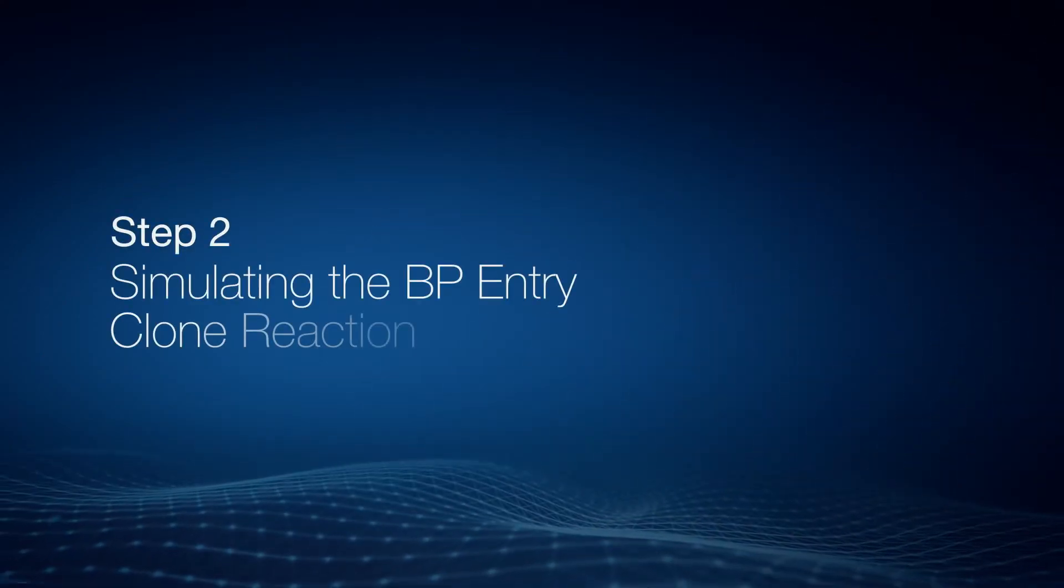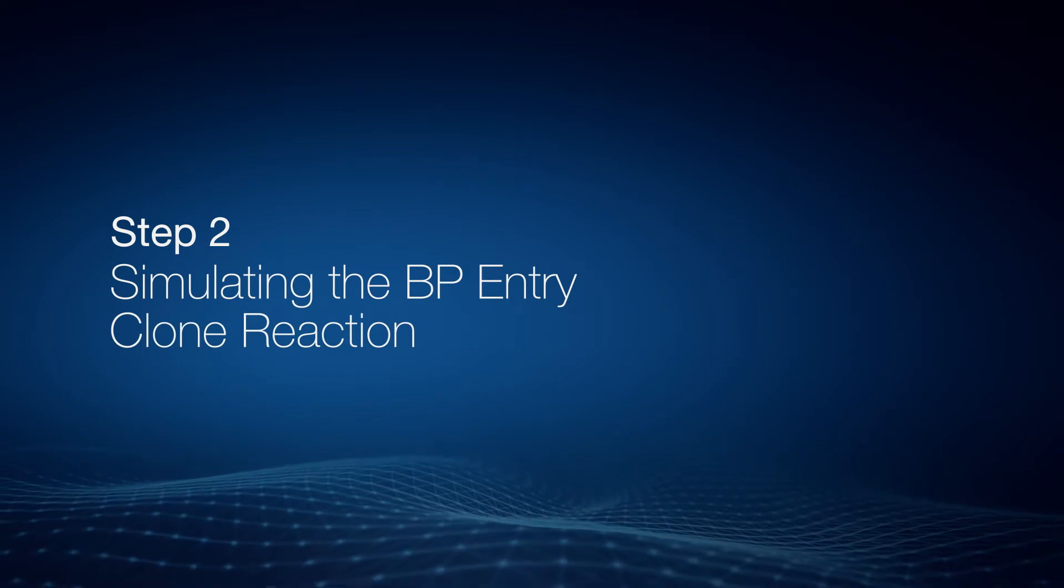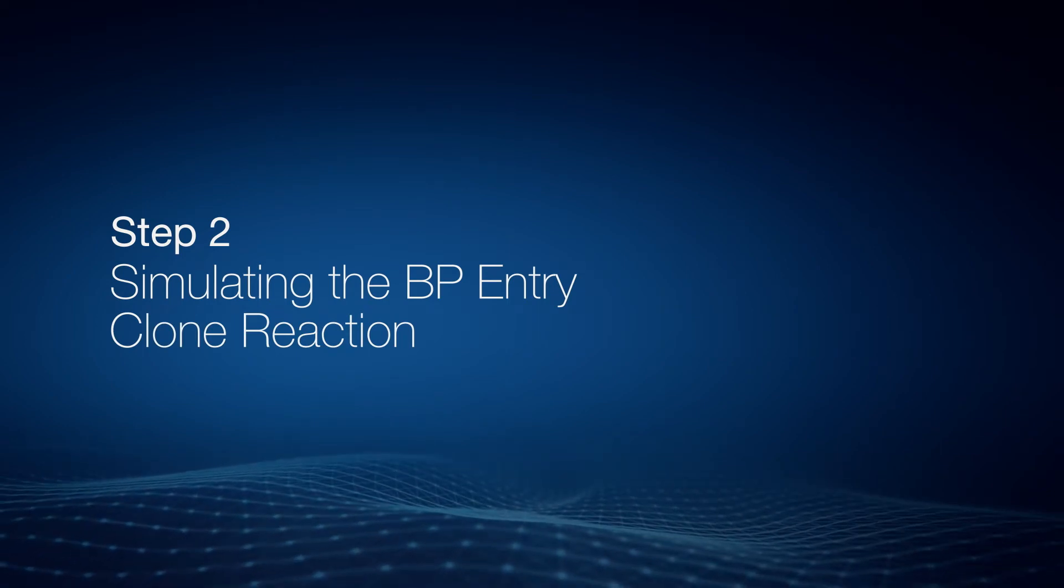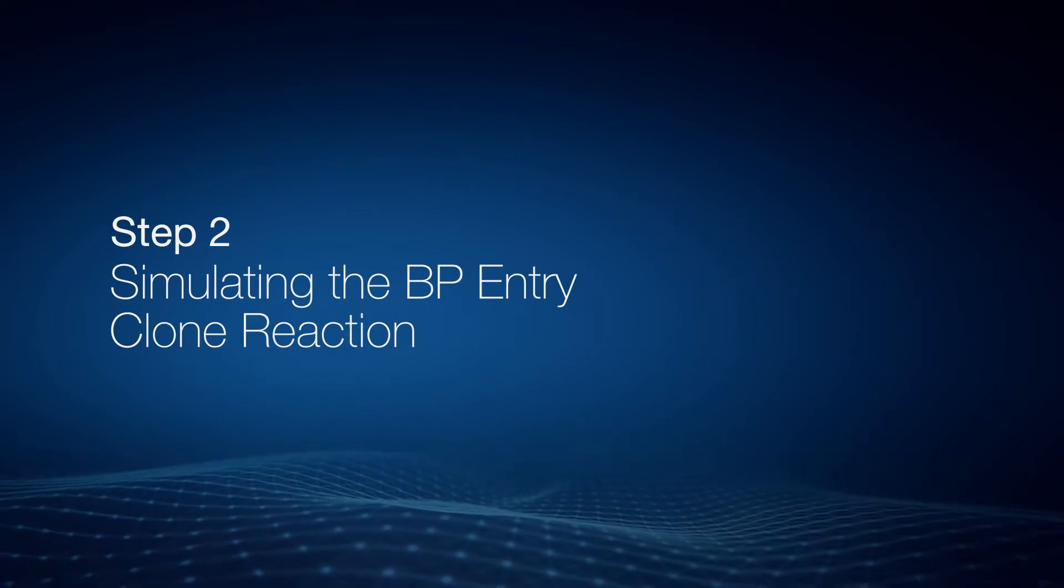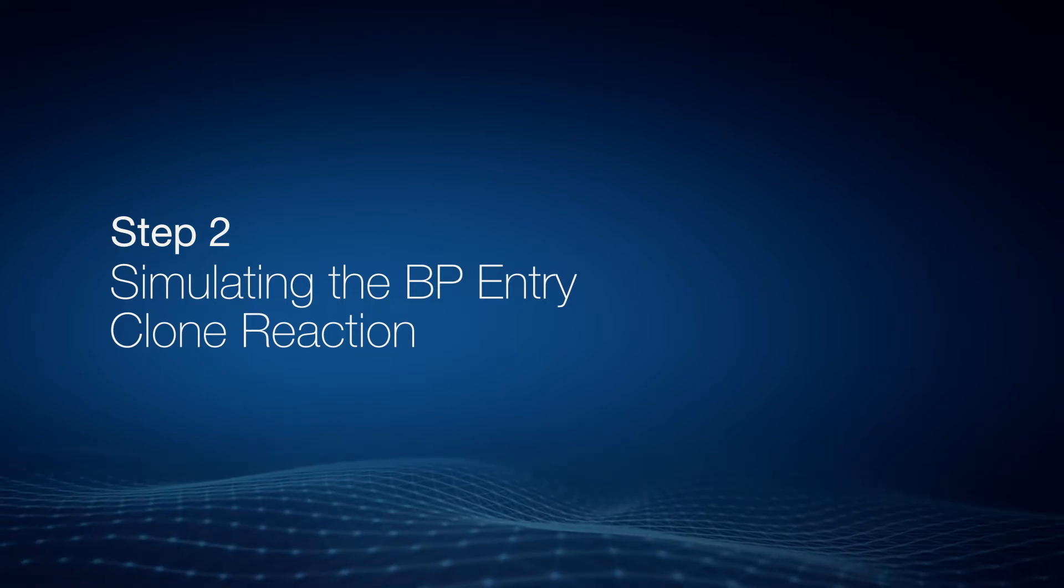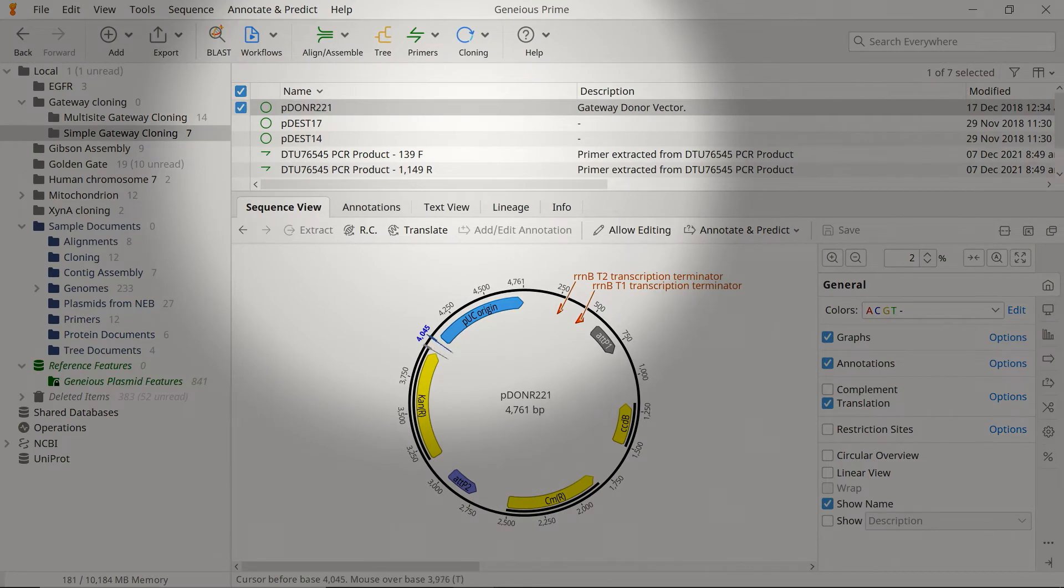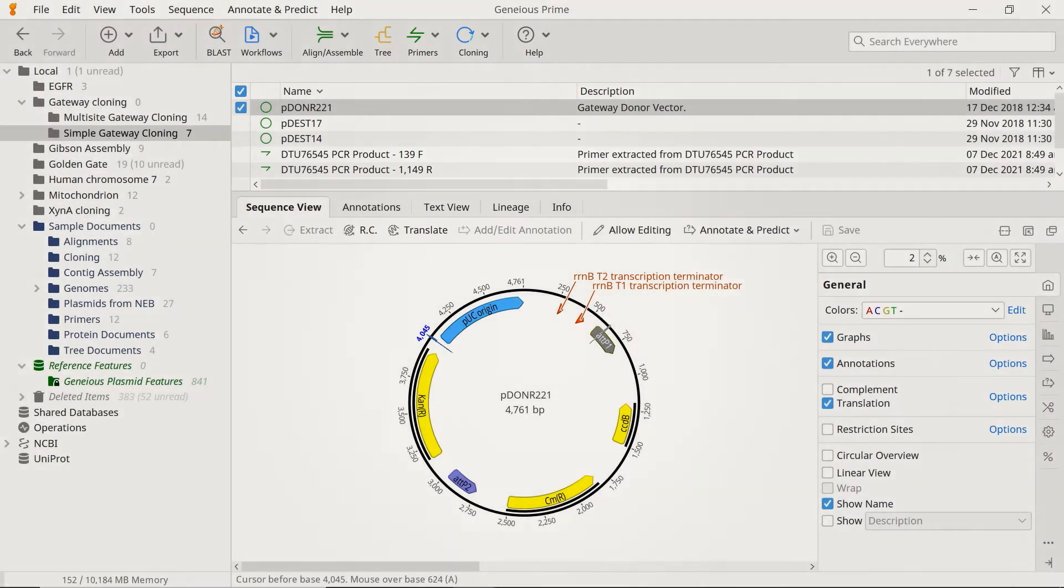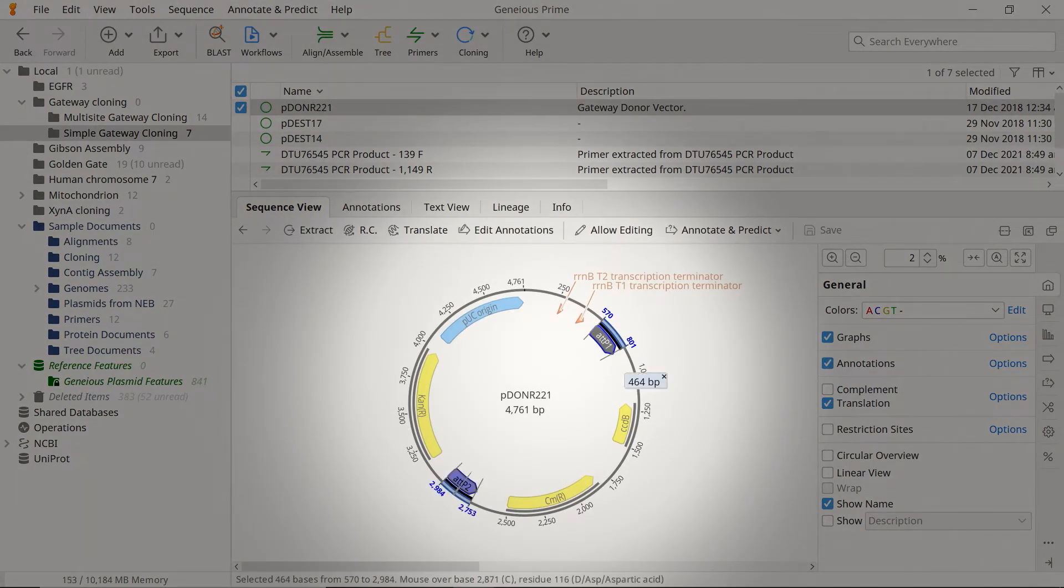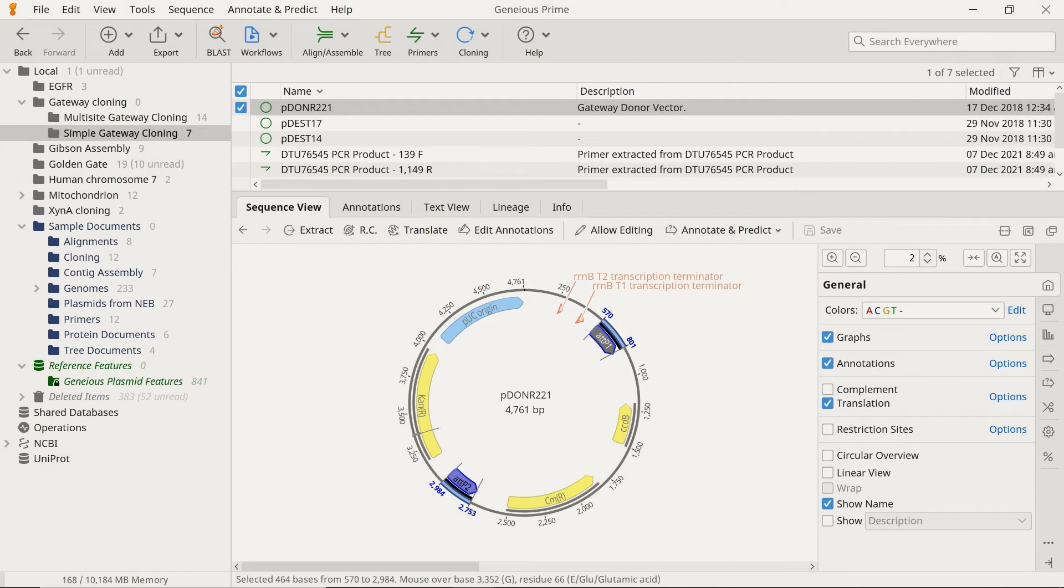Next, use the newly created PCR product, and perform a BP Clonase Reaction with a donor vector containing a set of attP sites. To simulate the BP reaction, you will require a donor vector, such as pDONR221. Donor vectors contain the attP1 and attP2 sites needed for the BP reaction. The reaction replaces this region with the PCR product flanked by the attB sites.